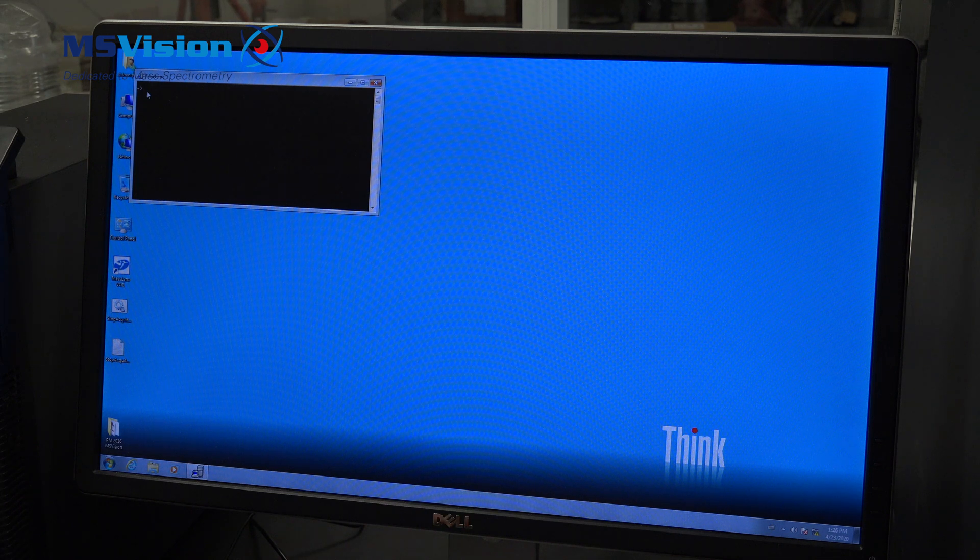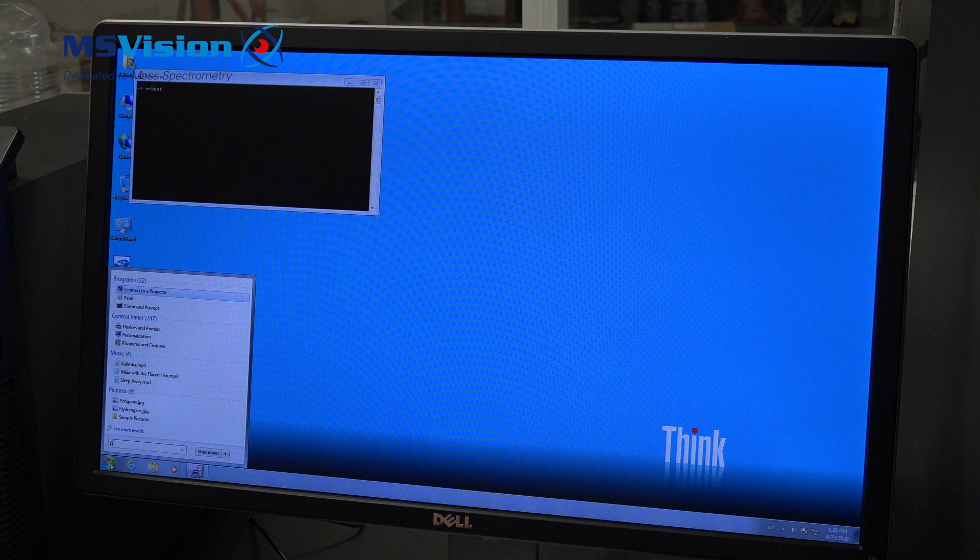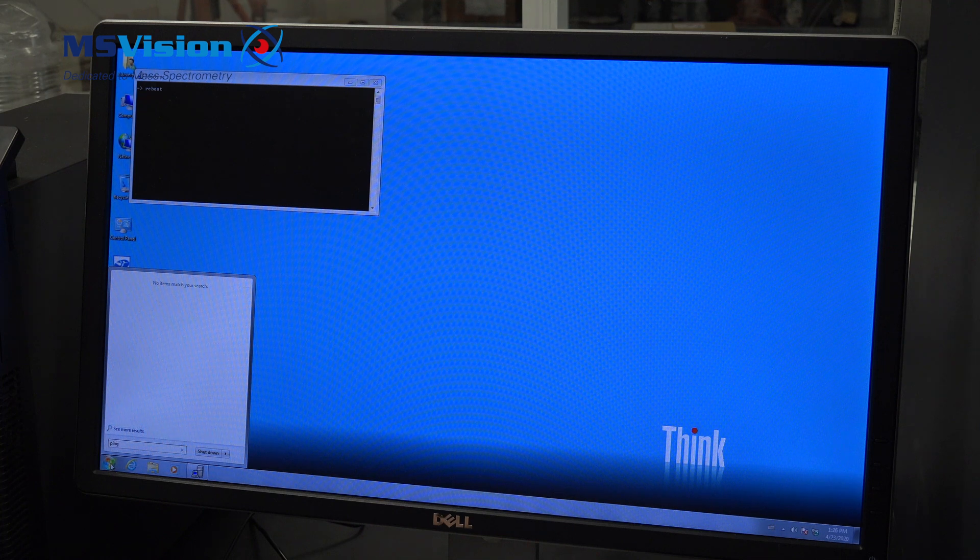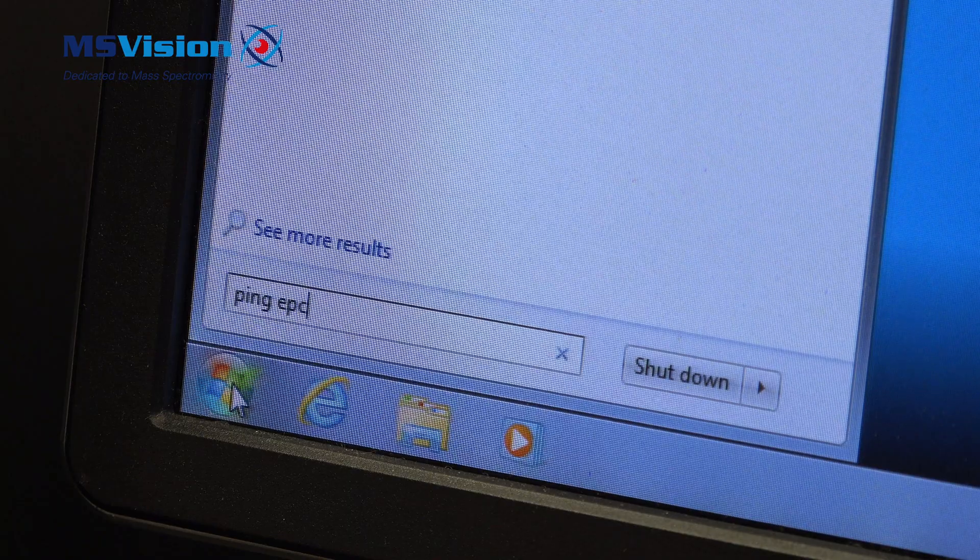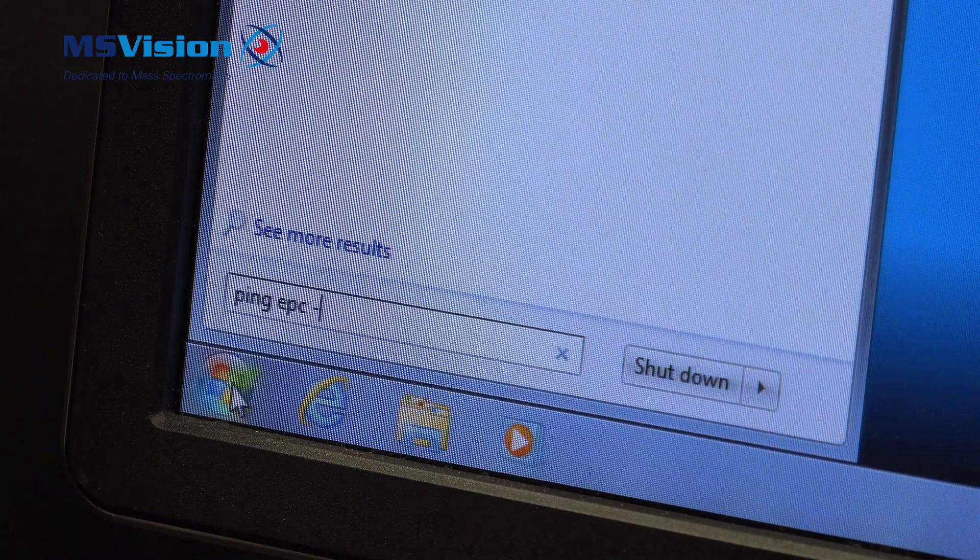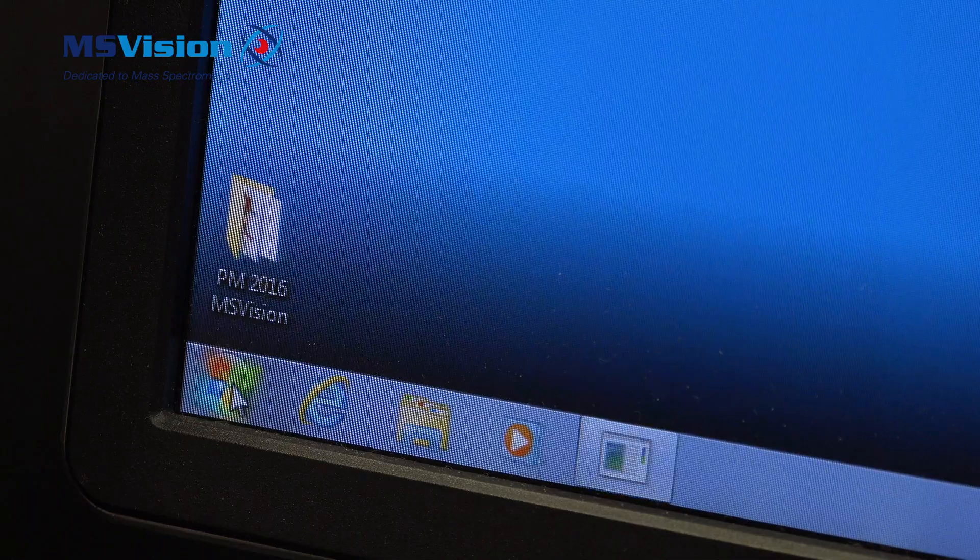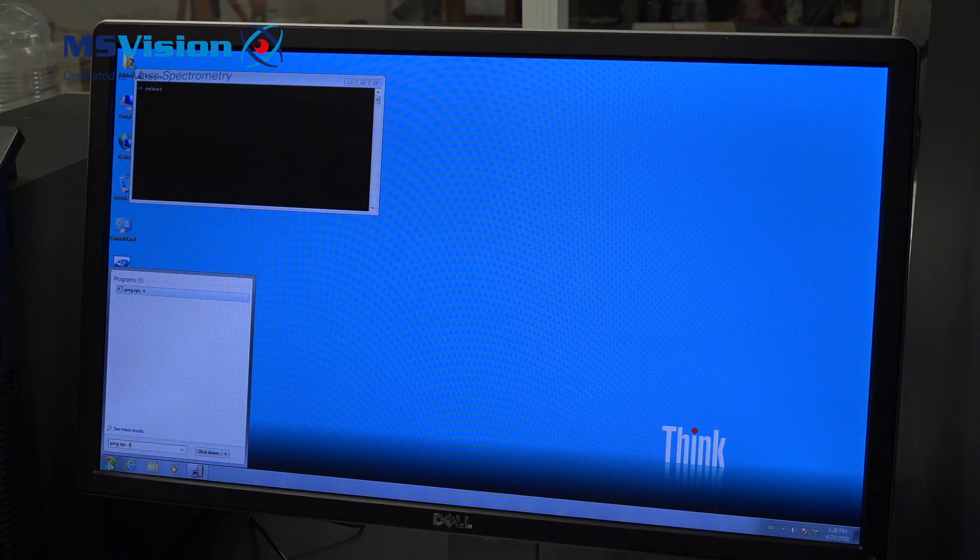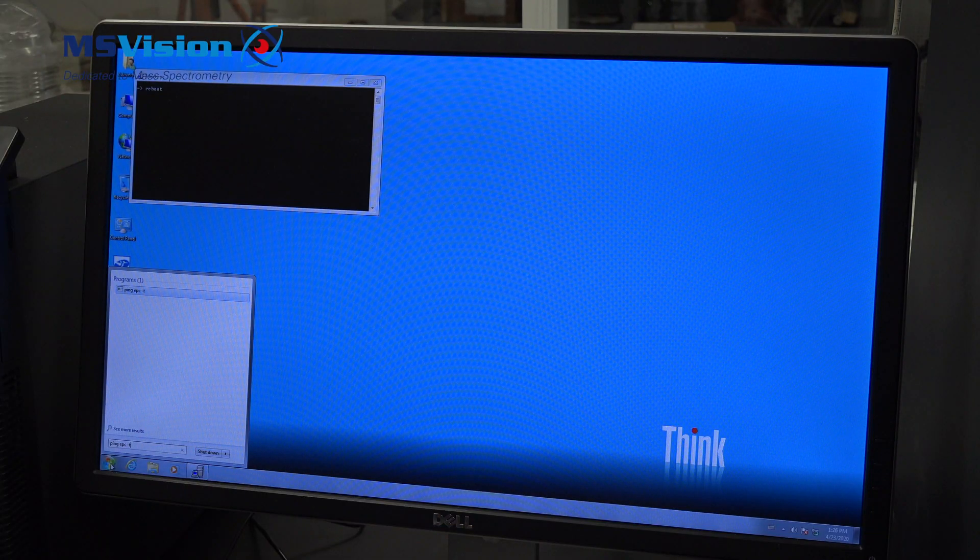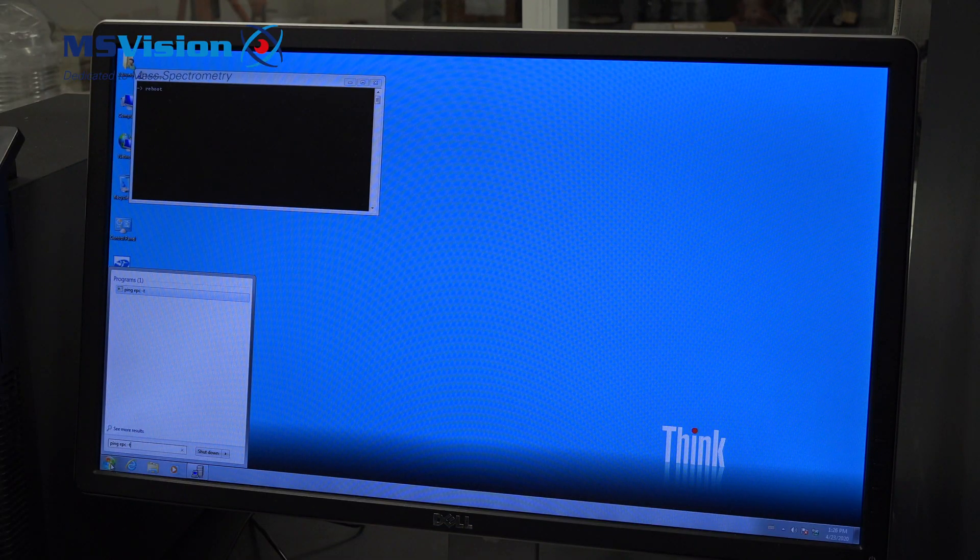Which is called ping EPC space minus T. That means it will continue to ping.